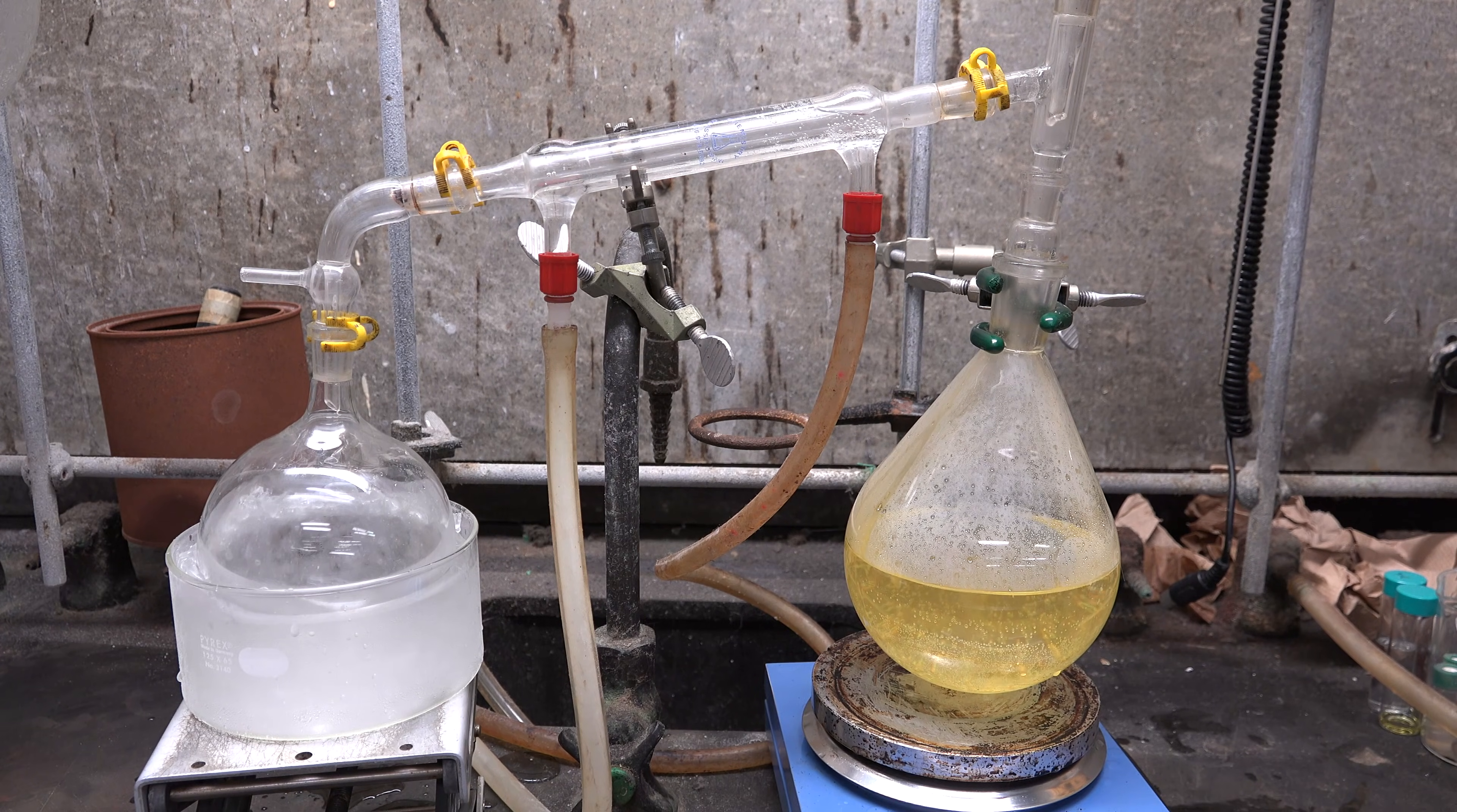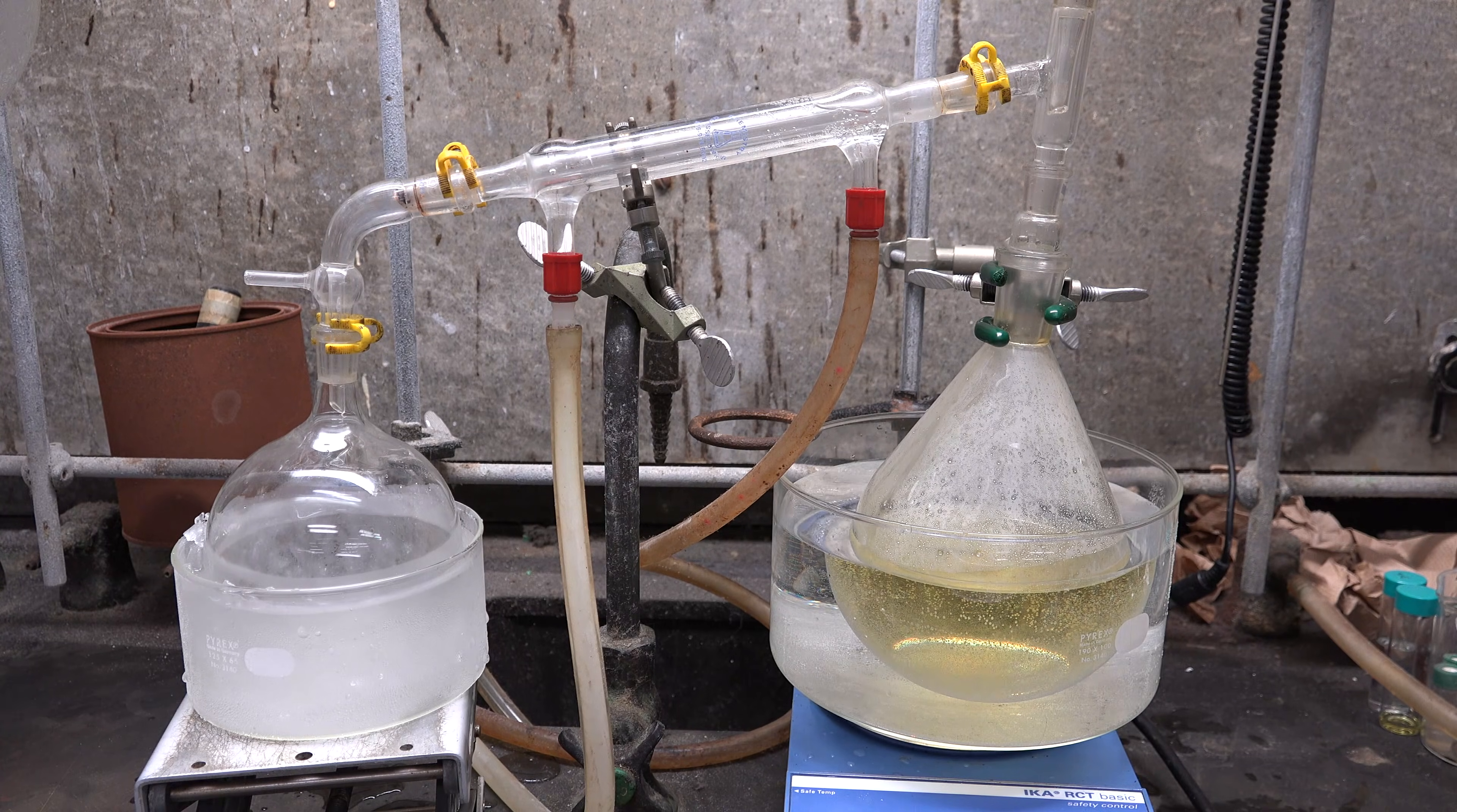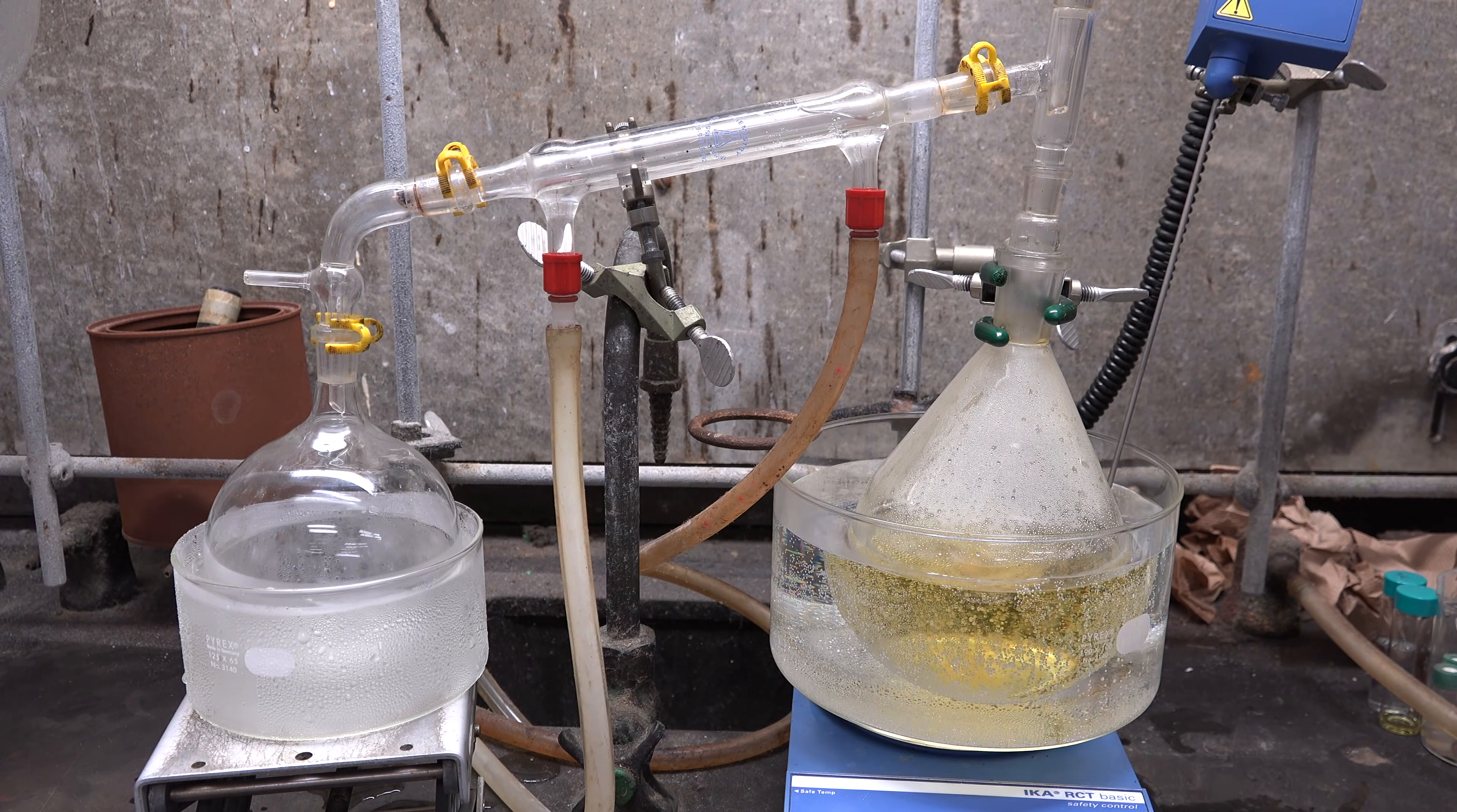As you can see we're already getting some condensation as the bromoethane vaporizes. Once all the sulfuric acid is added we place the boiling flask in a water bath and start heating. The water doesn't need to boil and in fact it would be best to adjust the temperature so you slowly condense the bromoethane and don't overshoot the cooling ability of your condenser. It would also be helpful to put a thermometer in your water bath and start at 40 degrees celsius. Gradually ramping up the temperature to a maximum of 70 degrees celsius as the dripping rate slows.